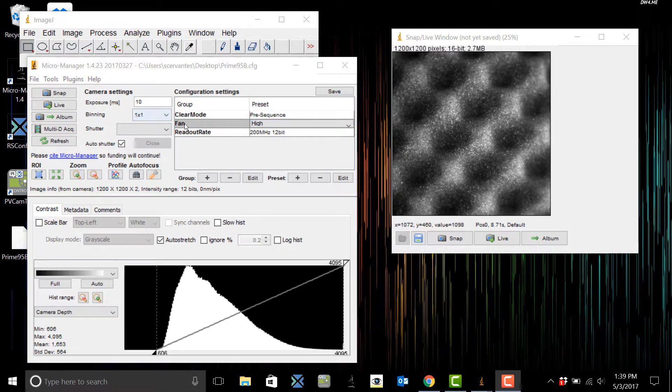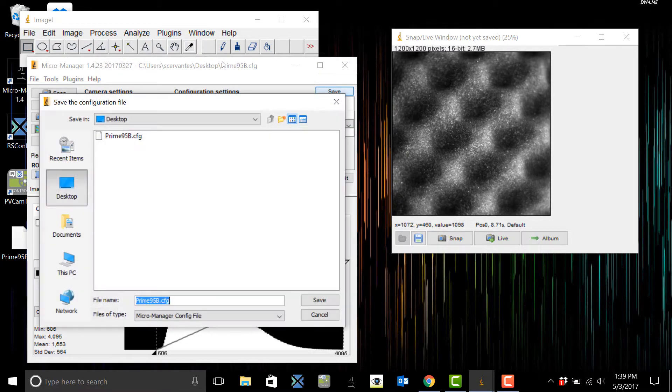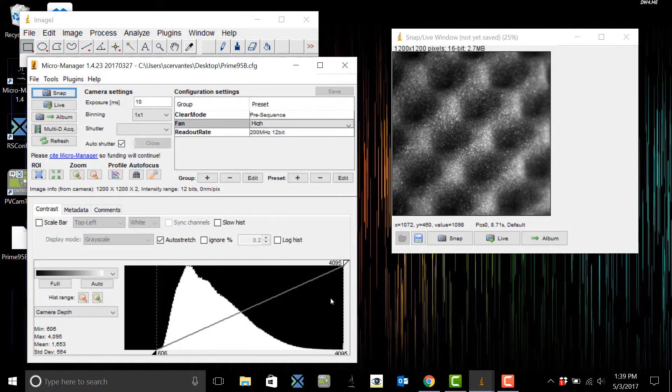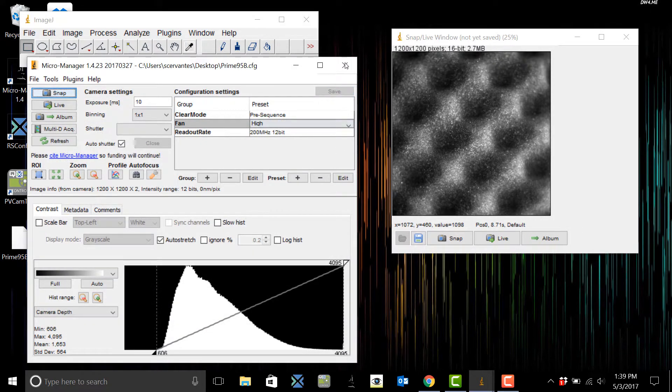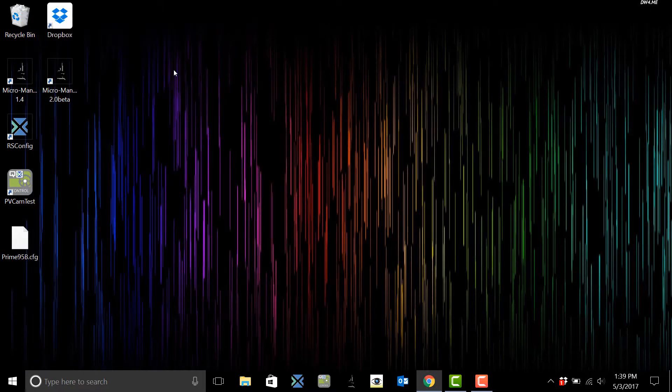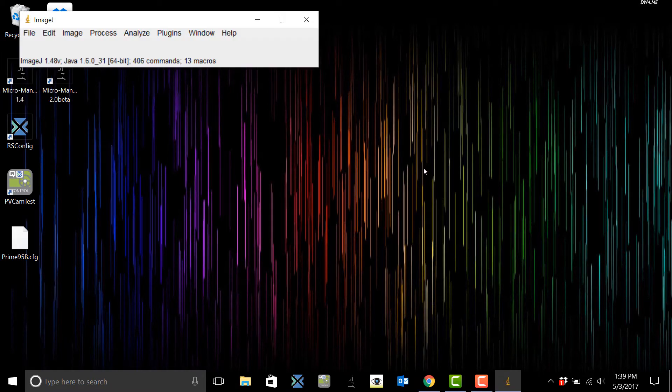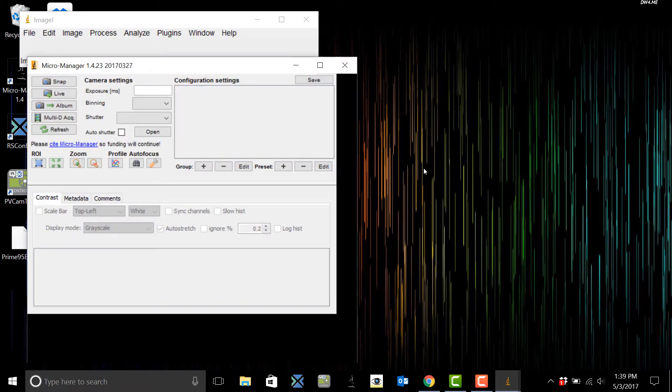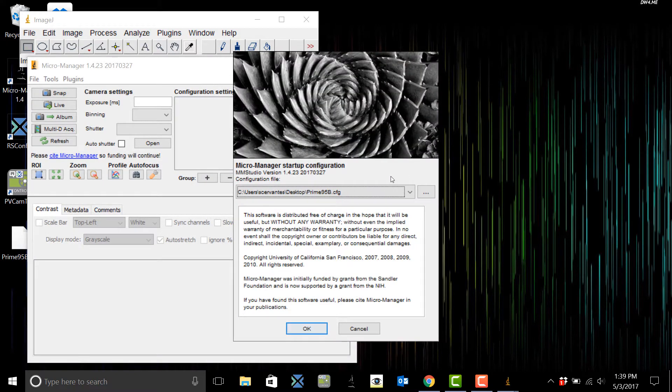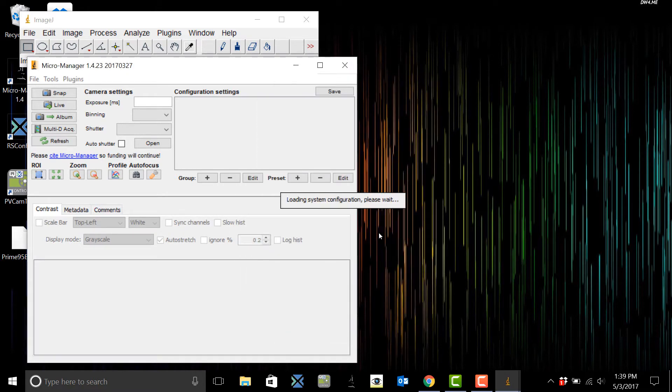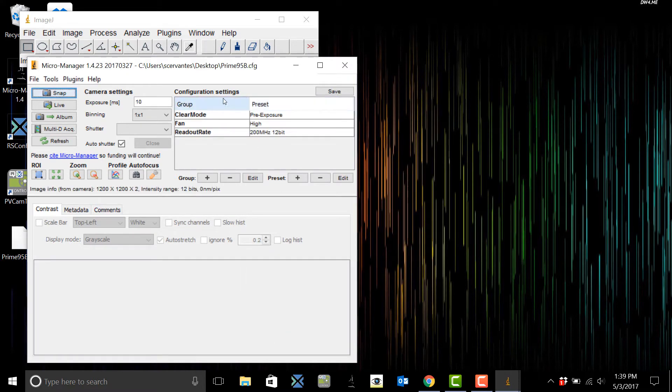OK, so now I'm going to save everything and override the file so that way when I close the software, when I click it back open and I select the 95b configuration and hit OK, my group settings should pop back up. There they are.